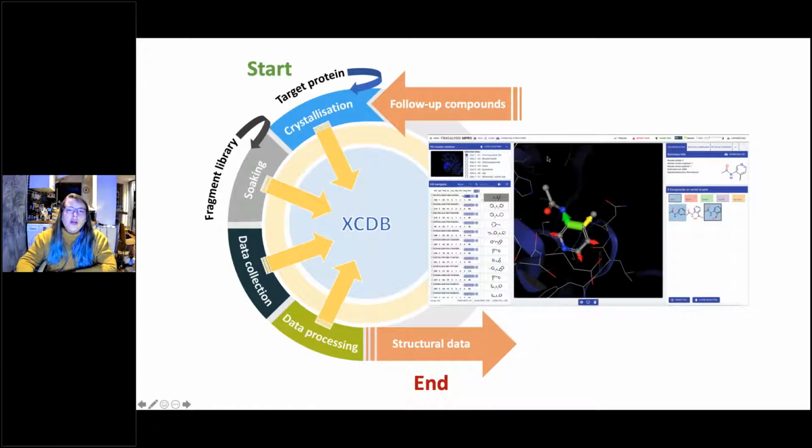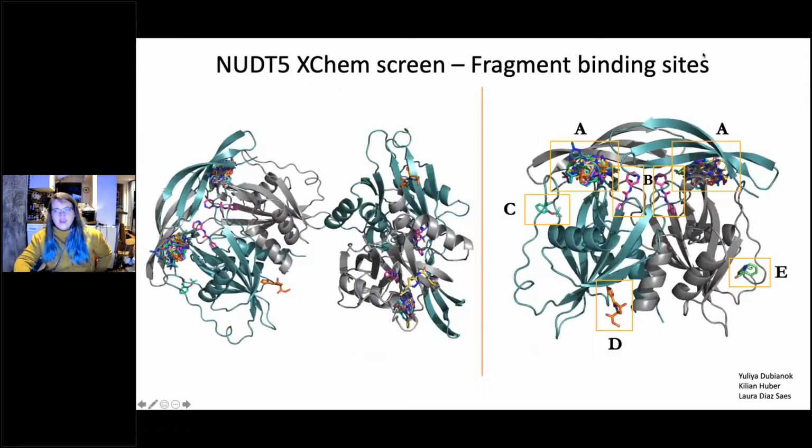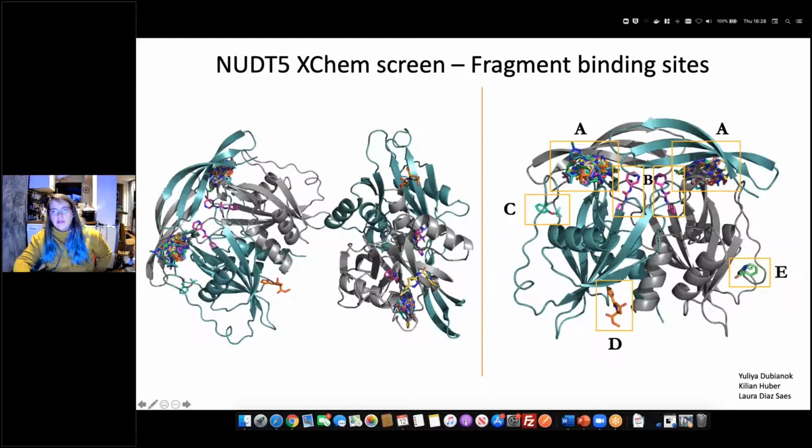So really what Fragalysis was initially designed for was to try and fill that gap between data coming out from a fragment screen and people not really knowing what to do with it, so that we could get our users back and support the academic community in being able to do this sort of stuff more routinely, and to pose this idea of looking at the data in a different way. So that's just coming back again to what our typical screen looks like.